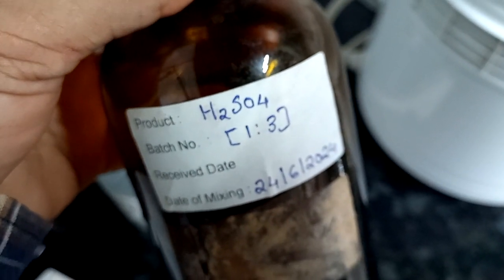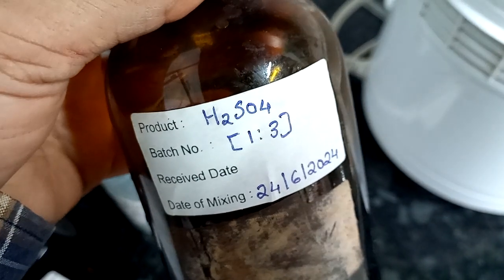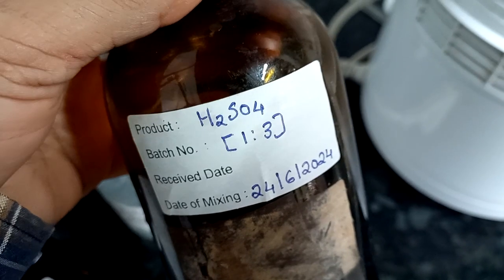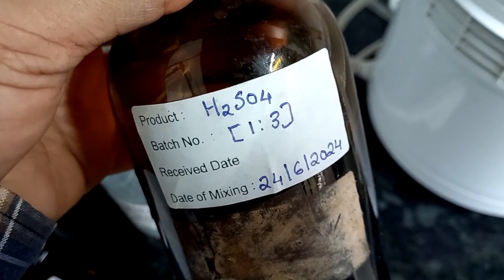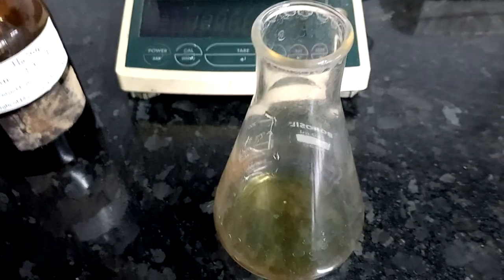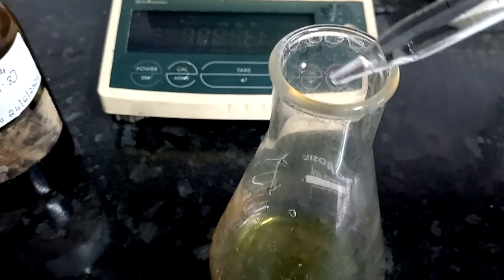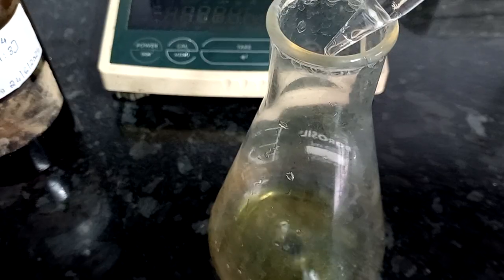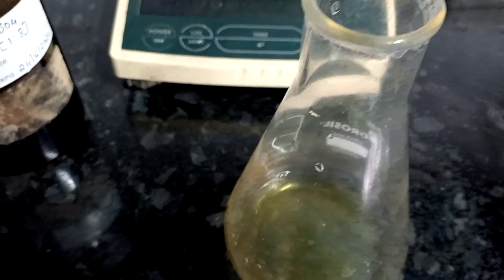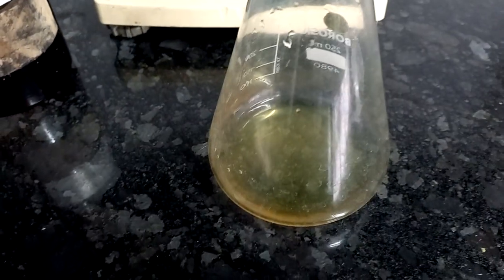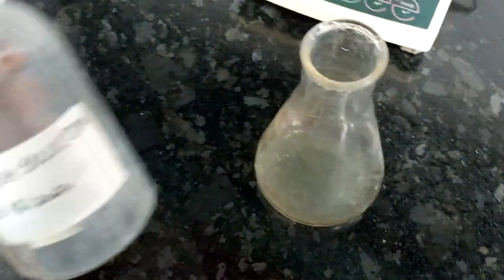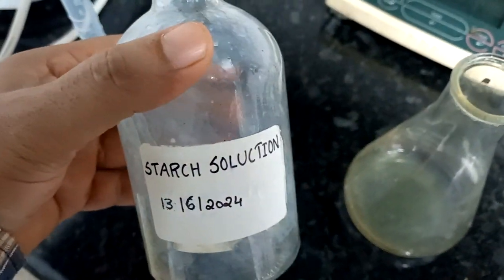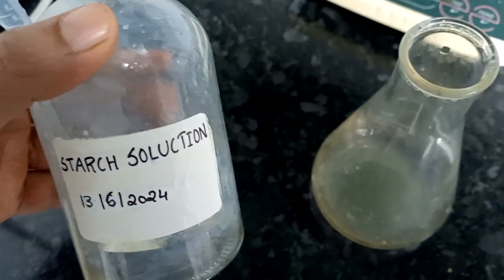Add 1 ml 1:3 H2SO4 solution into the sample solution. Shake well and add 1 to 2 drops of starch solution into the sample solution.